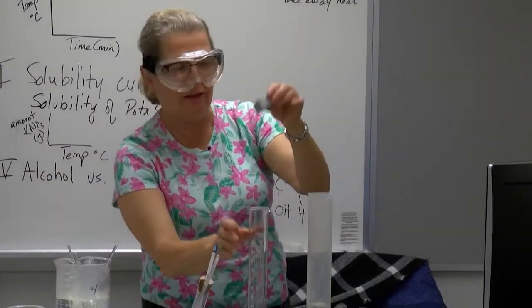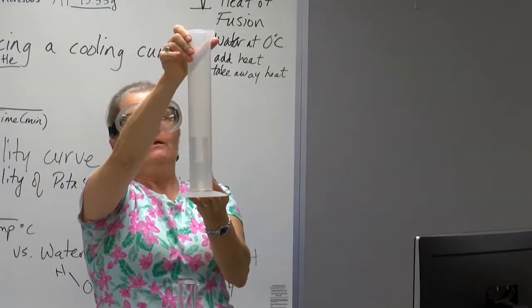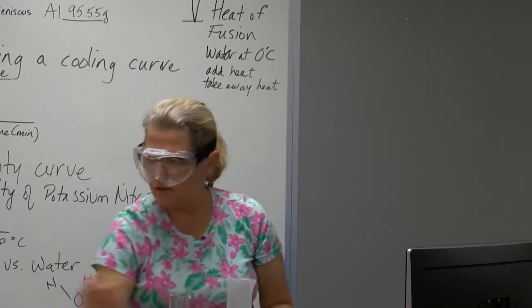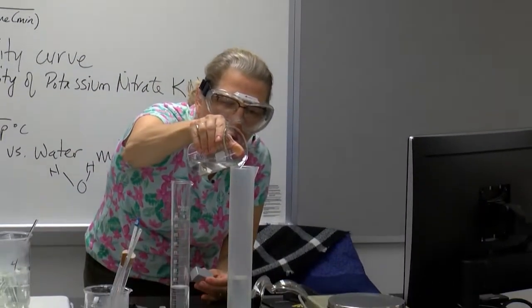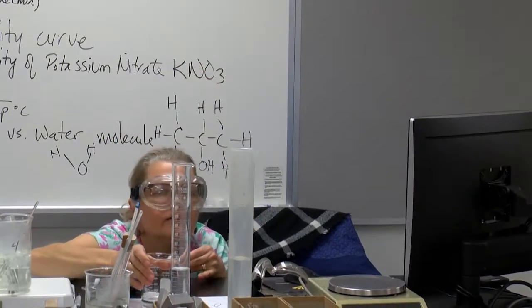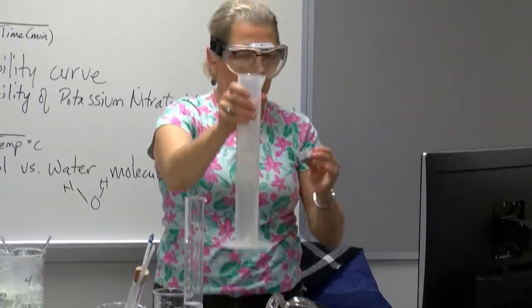Let me see if this one will fit in there. It will not. For some reason, I did not go to 200, so let me just put a little more in here. We want to start out with a nice even number. Okay, I have 200 milliliters of water.